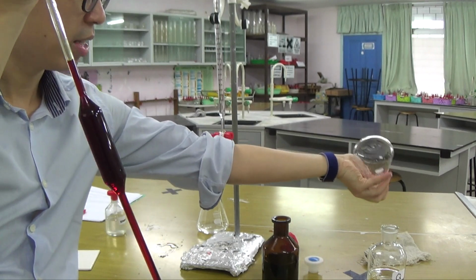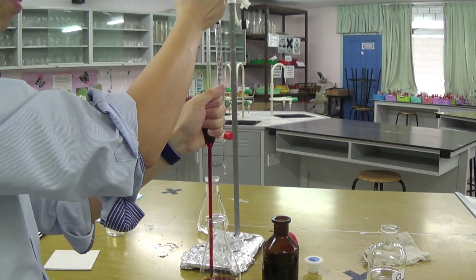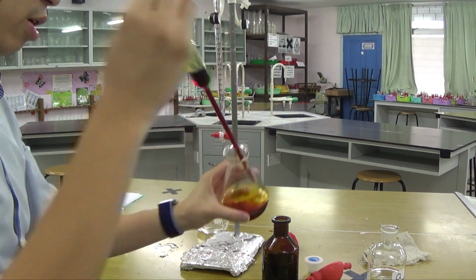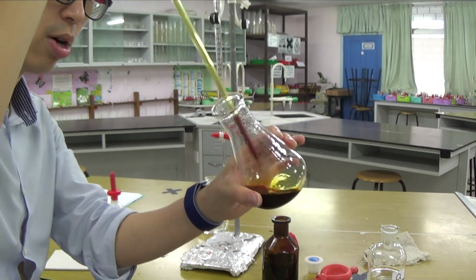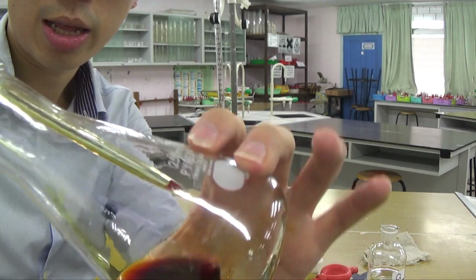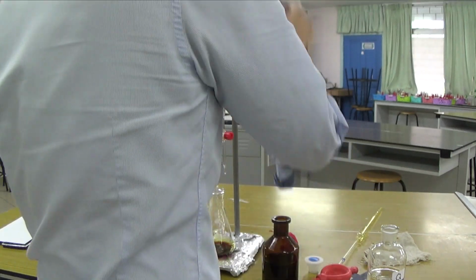Remember that a little bit of water will not affect the accurate mole of the substance that we prepared. If the mole of the stuff that we prepared is exactly the same going to the conical flask, it will not change the volume of the things in the burette, so it doesn't change our titre at all with a little bit of distilled water left in the conical flask. Just the last few drops, 1, 2, 3, 4, 5, 6, 7.